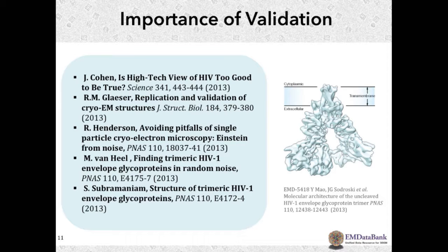So with the worldwide PDB, we have a kind of a standard process for trying to get validation going for different areas. So for X-ray, there was a validation task force that has met twice, chaired by Randy Read, and they took their task very seriously.